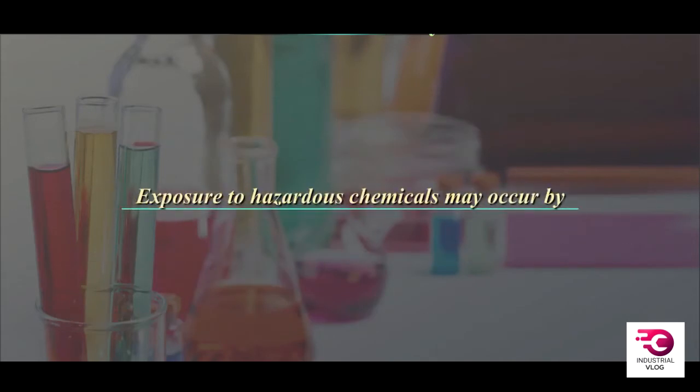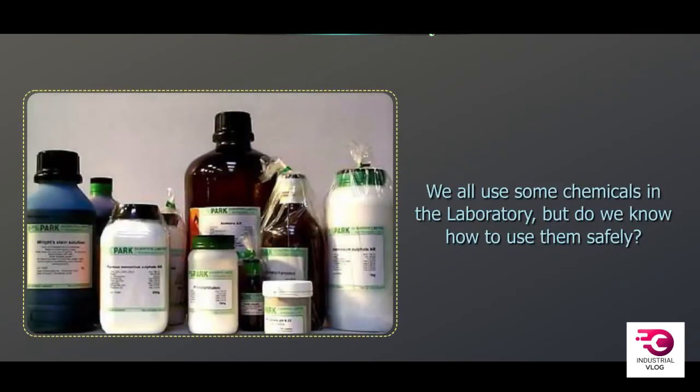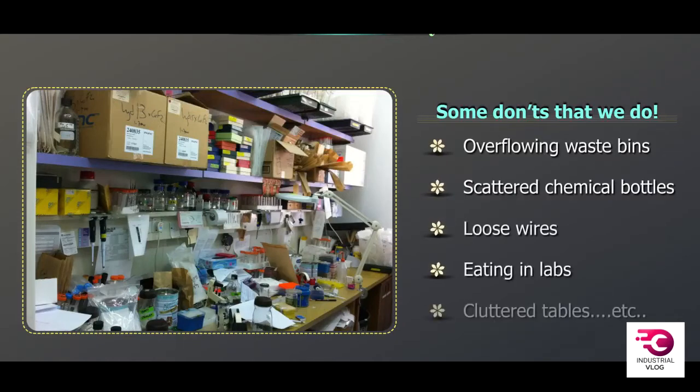Exposure to hazardous chemicals may occur by inhalation, contact, ingestion, or through broken skin. We all use some chemicals in the laboratory, but do we know how to use them safely? Some don't. Overflowing waste bins, scattered chemical bottles, loose wires, eating in labs, cluttered tables, etc.